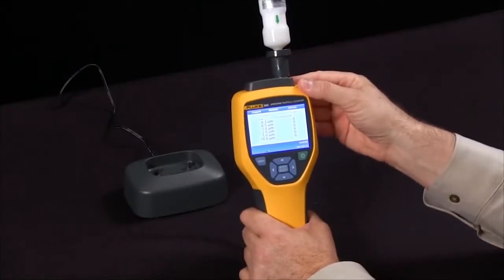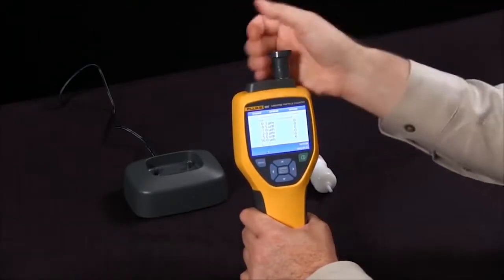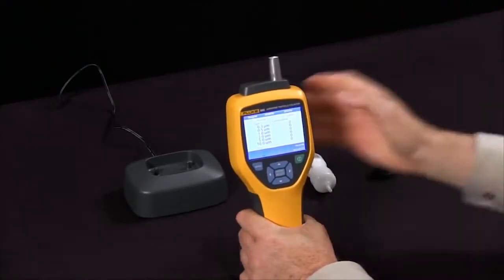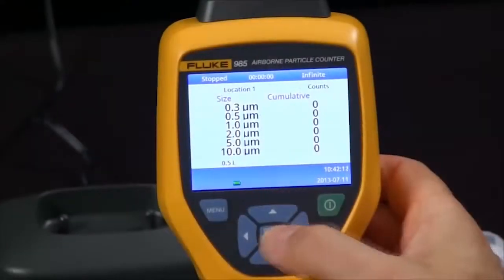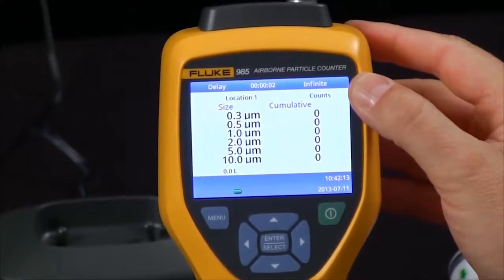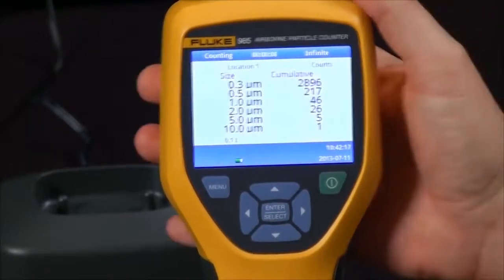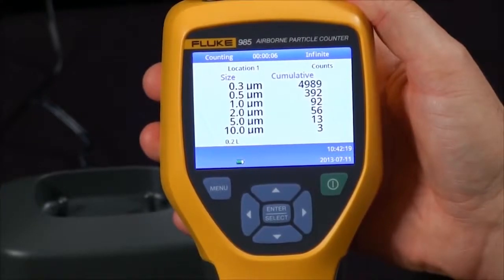Now we're ready to take a sample. Simply take off the zero pass filter and the adapter and then we can start our reading. Simply press the sample button again and you will see that our particle count is accumulating according to what we have in the air.